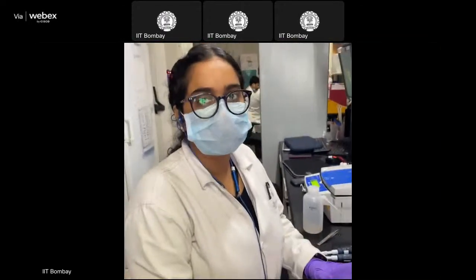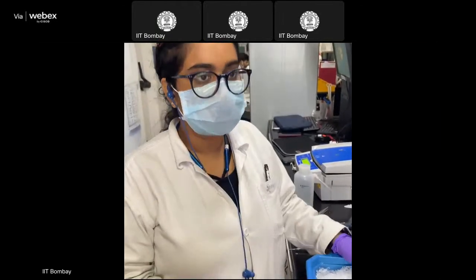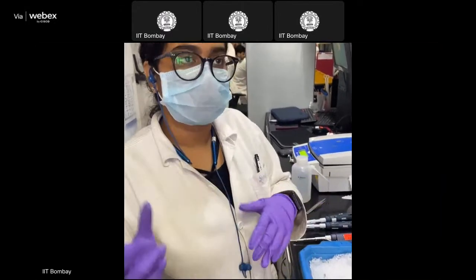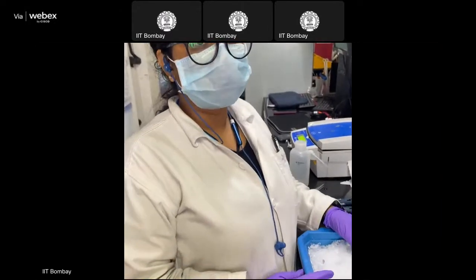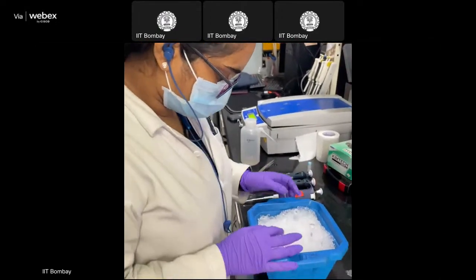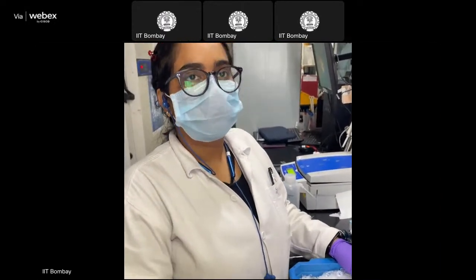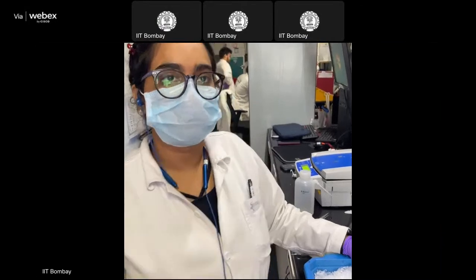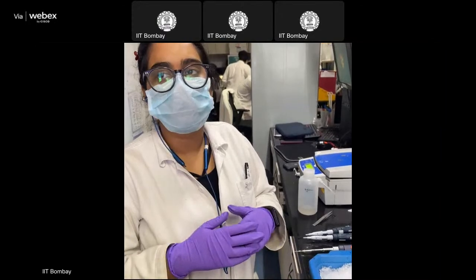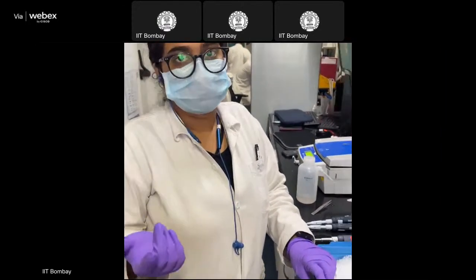Now you got your protein, and you do a QC check that the lysate is proper and there is no problem with your lysate preparation. Then you can go ahead with the protein digestion, which will make the protein into smaller peptides. For that, we are doing proteolytic digestion with the help of trypsin. What are the steps involved in the digestion? First is the addition of TCEP or DTT, which you can use to reduce the bonds. It will cleave all the disulfide bonds present in the protein.